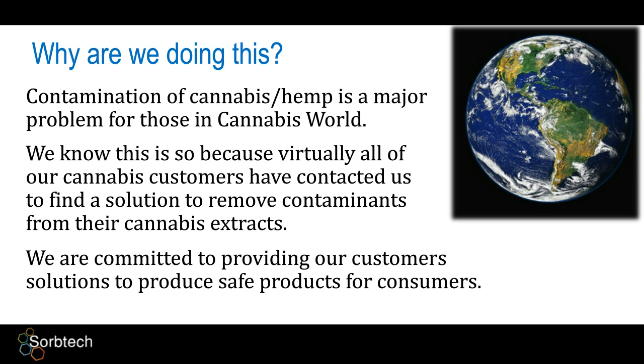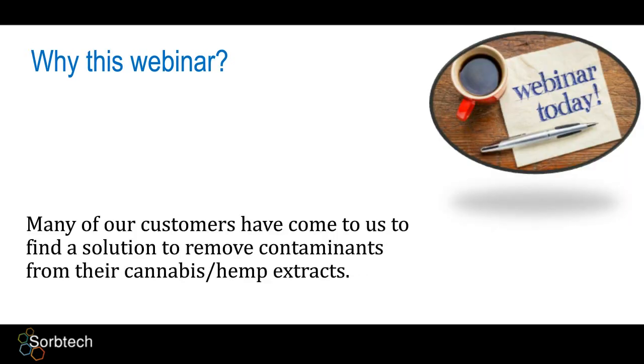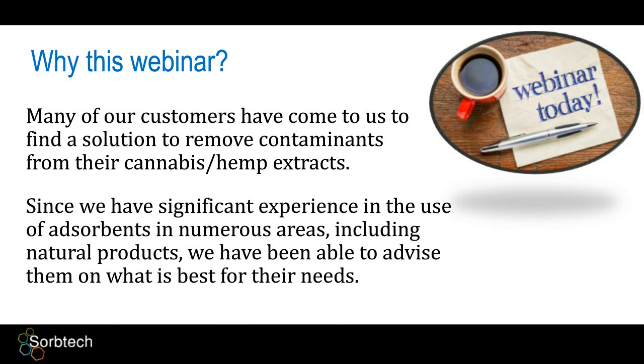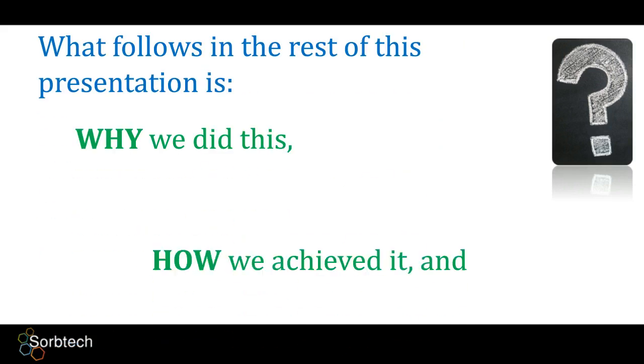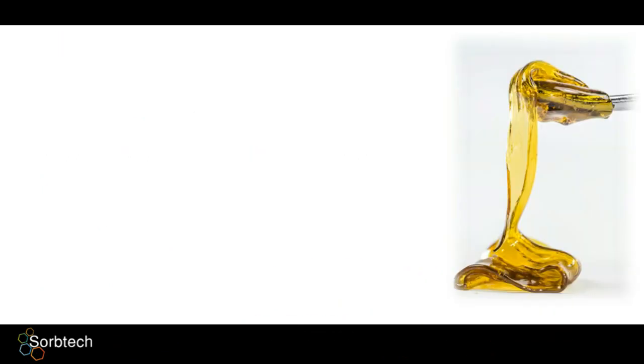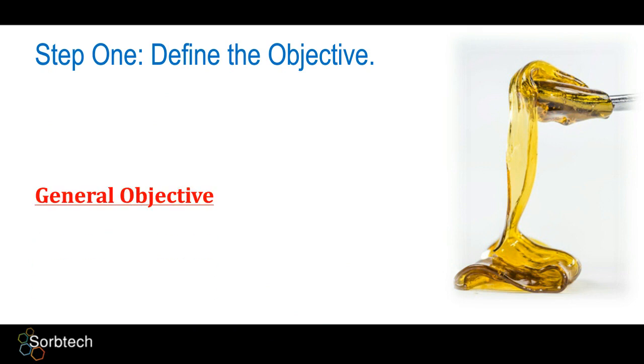So many of our customers have come to us to find a solution to remove contaminants from their cannabis or hemp extracts, and we have significant experience in the use of adsorbents in numerous areas, including natural products, which is where I personally cut my teeth, and we have been able to advise them on what is best for their needs. So what follows in the rest of this presentation is why we did this, how we achieved it, and how you can achieve it. The first step in any endeavor is to define your objective.